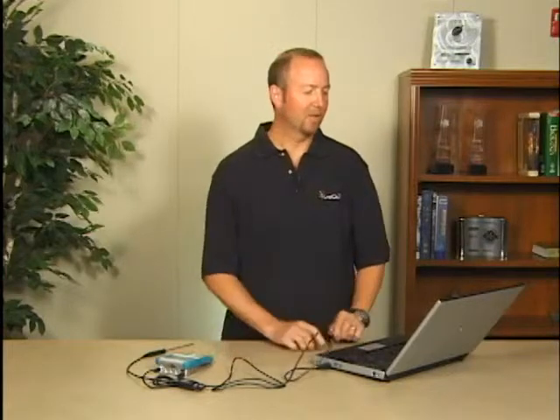Now the computer's found the LabQuest, we're going to launch Logger Lite software, which came in the box with LabQuest. LabQuest is also compatible with Logger Pro software if you need more advanced features or already have that software.